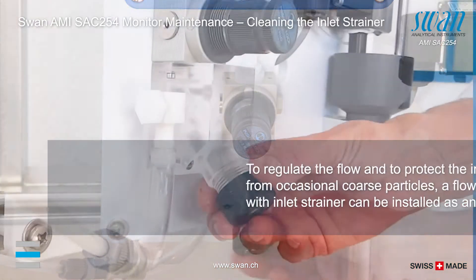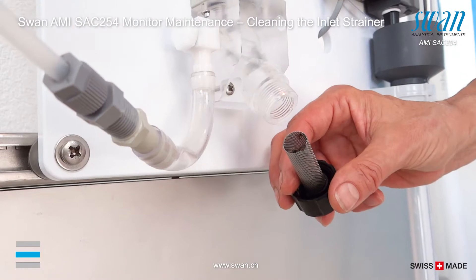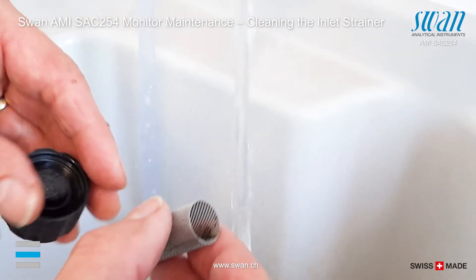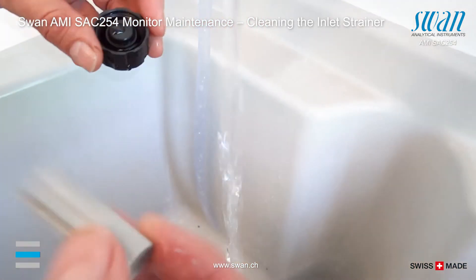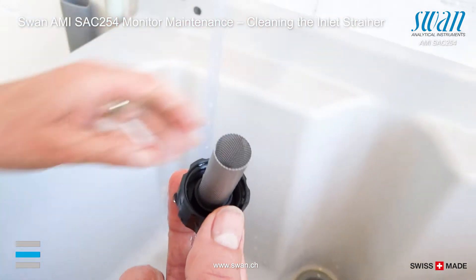If the flow controller option is installed, the inlet strainer has to be cleaned. Unscrew the cap and remove the inlet strainer from the flow. After removing dirt, reassemble the inlet strainer.